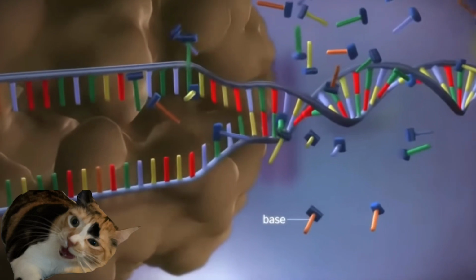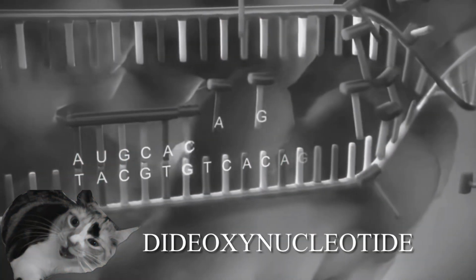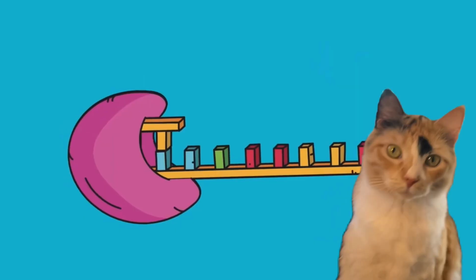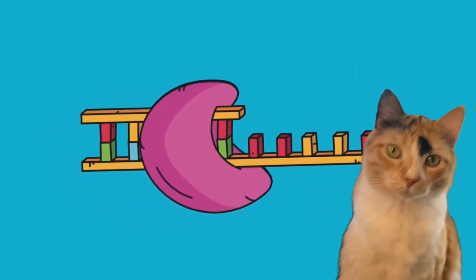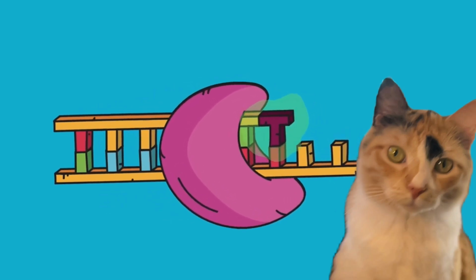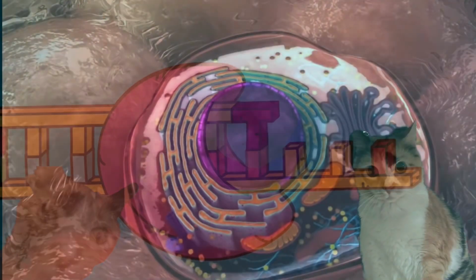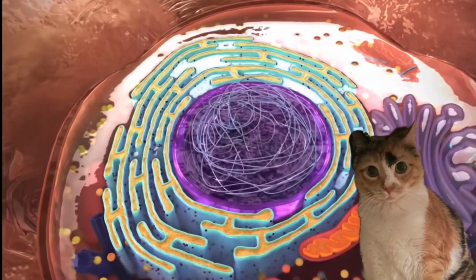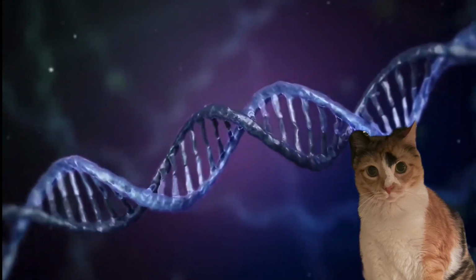DNA polymerase then lengthens the newly made strand until it randomly places a dideoxynucleotide. This dideoxynucleotide has a missing hydroxyl group. The hydroxyl group allows for nucleotides to bind to one another. It missing means that the chain has become terminated. It should also be noted that these terminations have an almost fluorescent color to them.